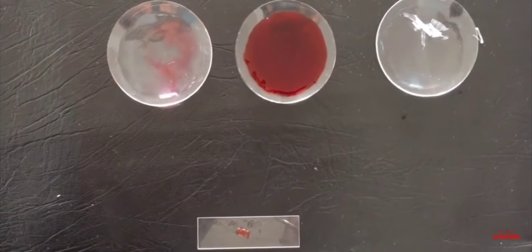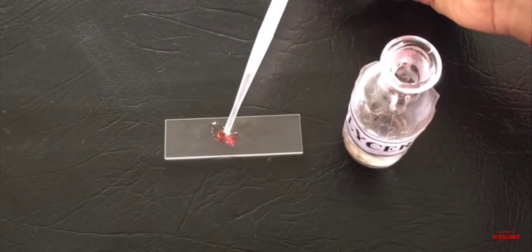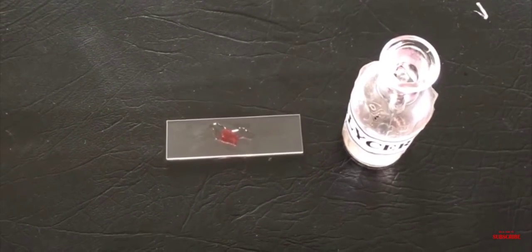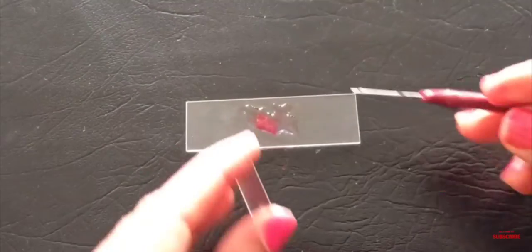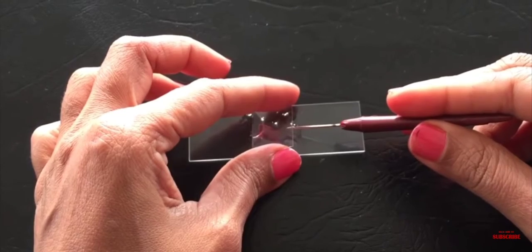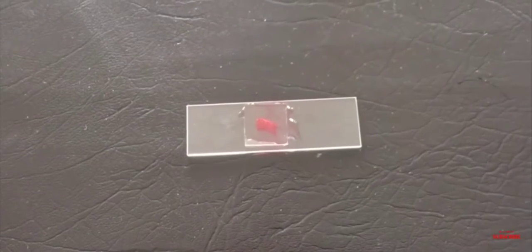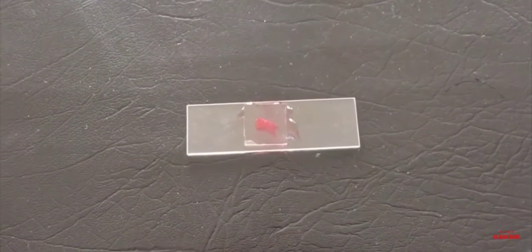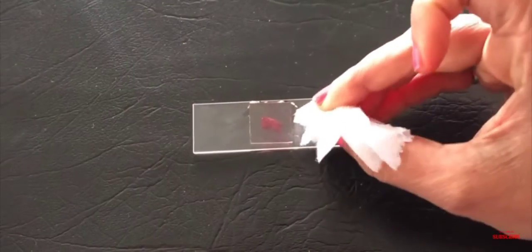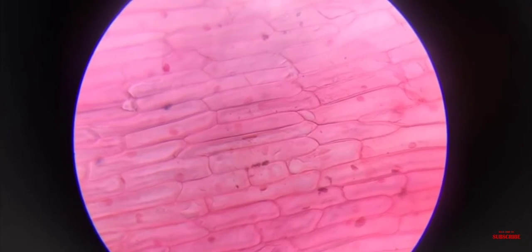Then put it on the slide. If you want, one drop of glycerin can be added more, and then with the help of a brush the peel has to be spread evenly, not with the needle. If we use a needle to spread, then it may break. Then place the cover slip and with the help of a needle slightly slantingly drop it over the peel of onion. By doing this, the bubbles will not be formed. Extra glycerin or stain should be rubbed off by using a tissue paper or a blotting paper. Place it under the microscope and adjust it and observe.